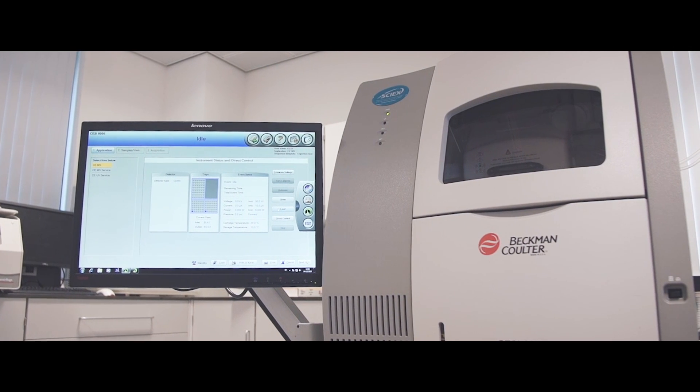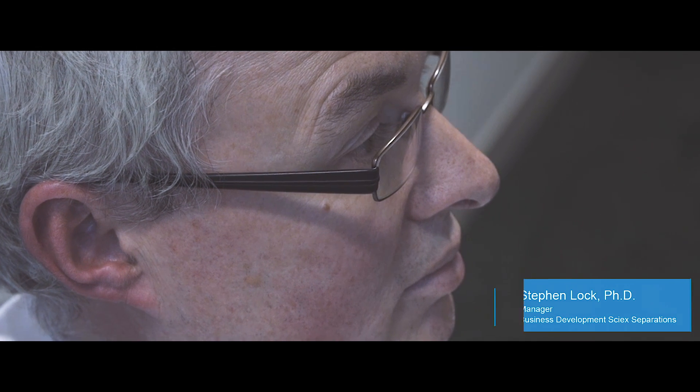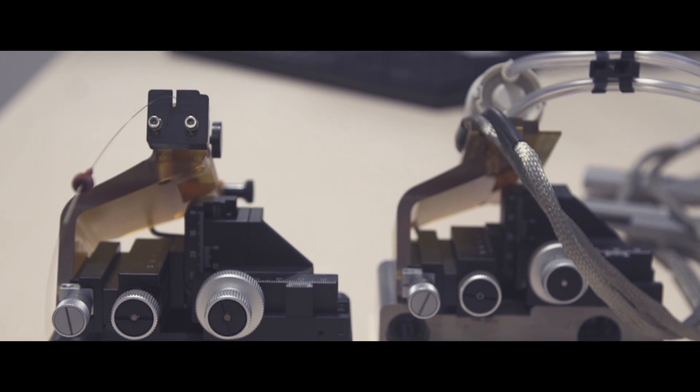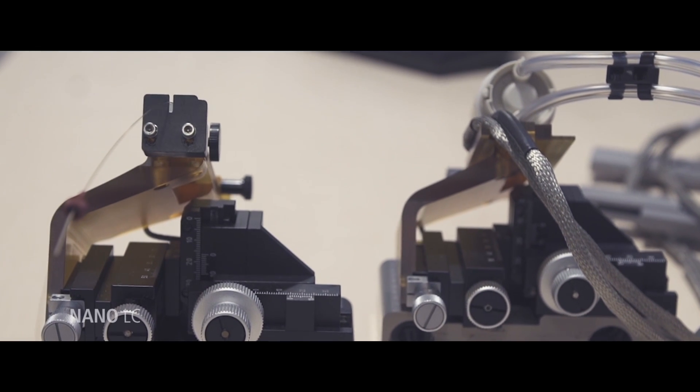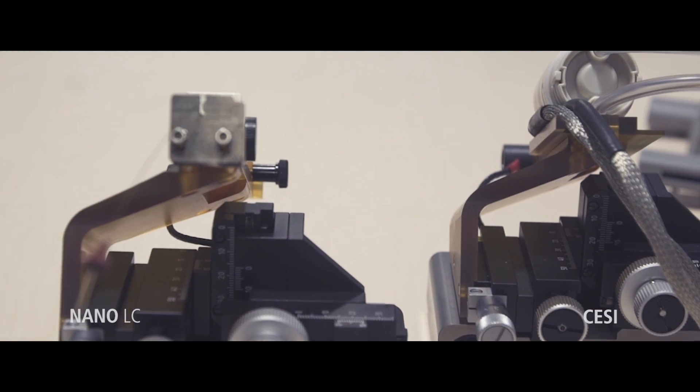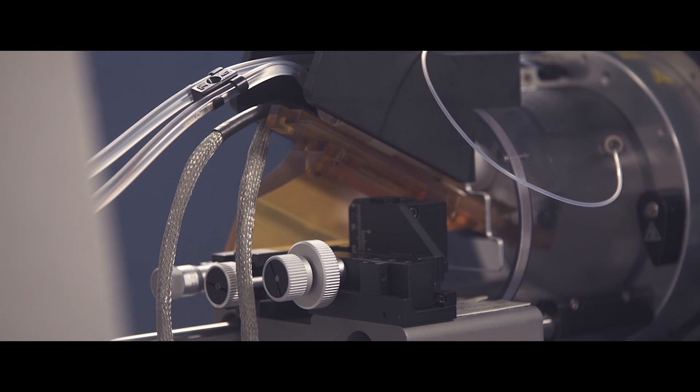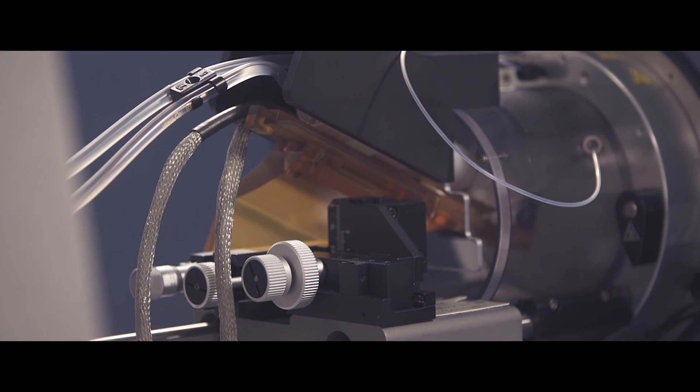I've been working with LC and LCMS systems for over 20 years. The main difference between nano LC and CSI connecting to a mass spec is the issue of dead volume.